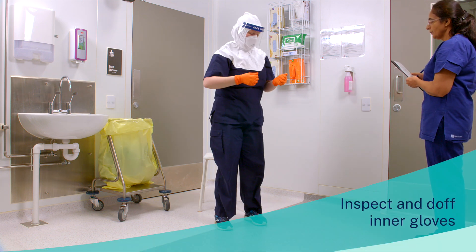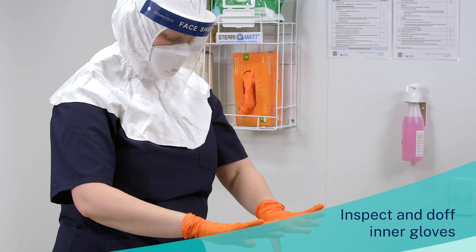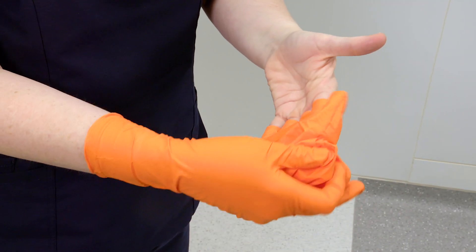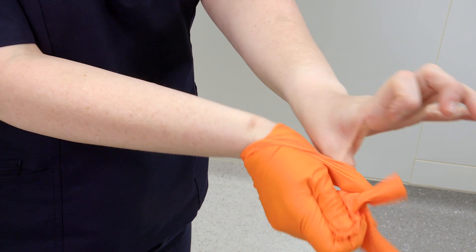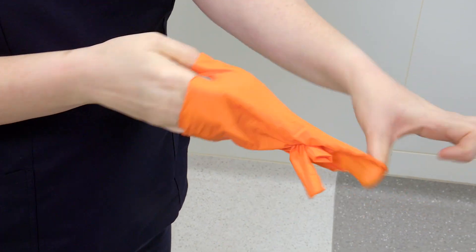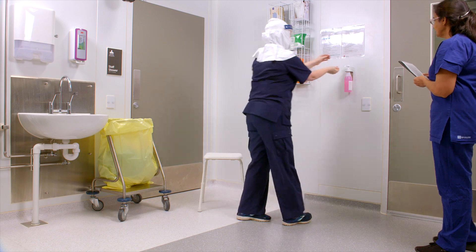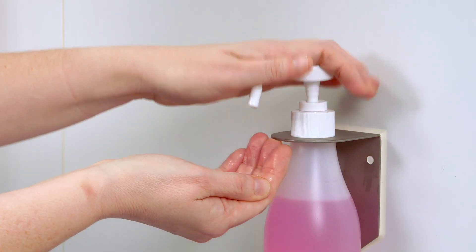Inspect and doff the inner gloves. Perform hand hygiene and don another pair of gloves.